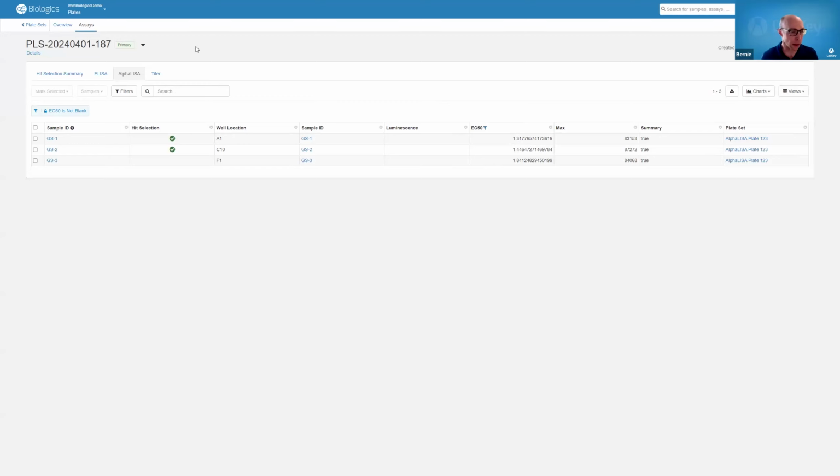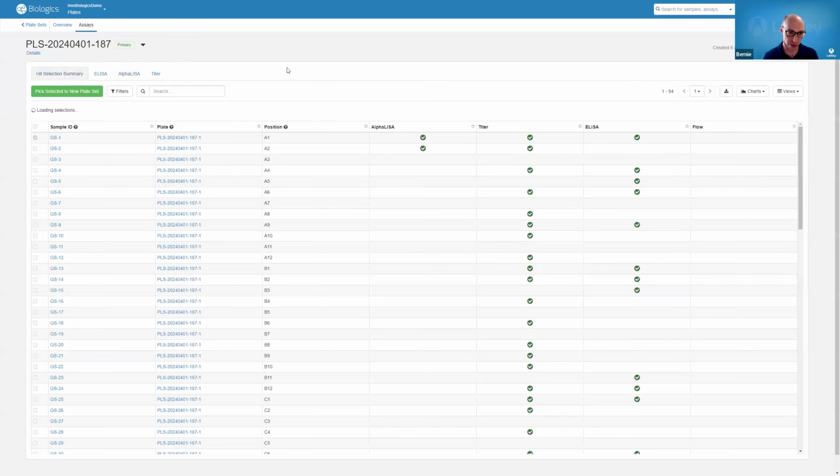Okay. I hope that paints a picture generally of how you can walk through initial screening and characterization of some of these materials. All kinds of other sample operations, discovery and development operations, are supported in this system. But I just wanted to give that initial walkthrough. I'm going to switch back over here.